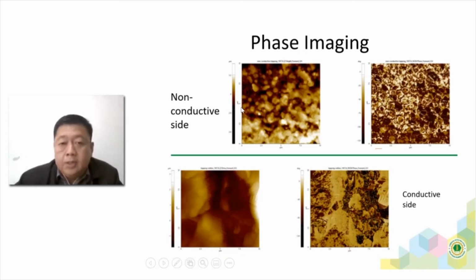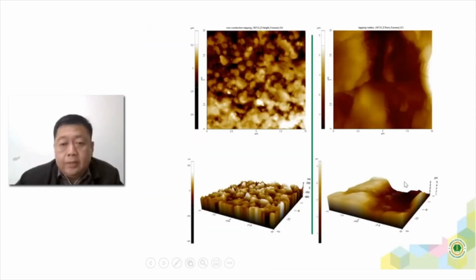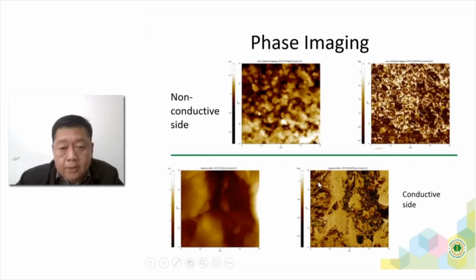If you can see, the 3D image here is the valley of that particular surface that we analyzed. And not only that, on the left side here, you can still see some black color stuff. So these are actually a totally different material as compared to rubber.